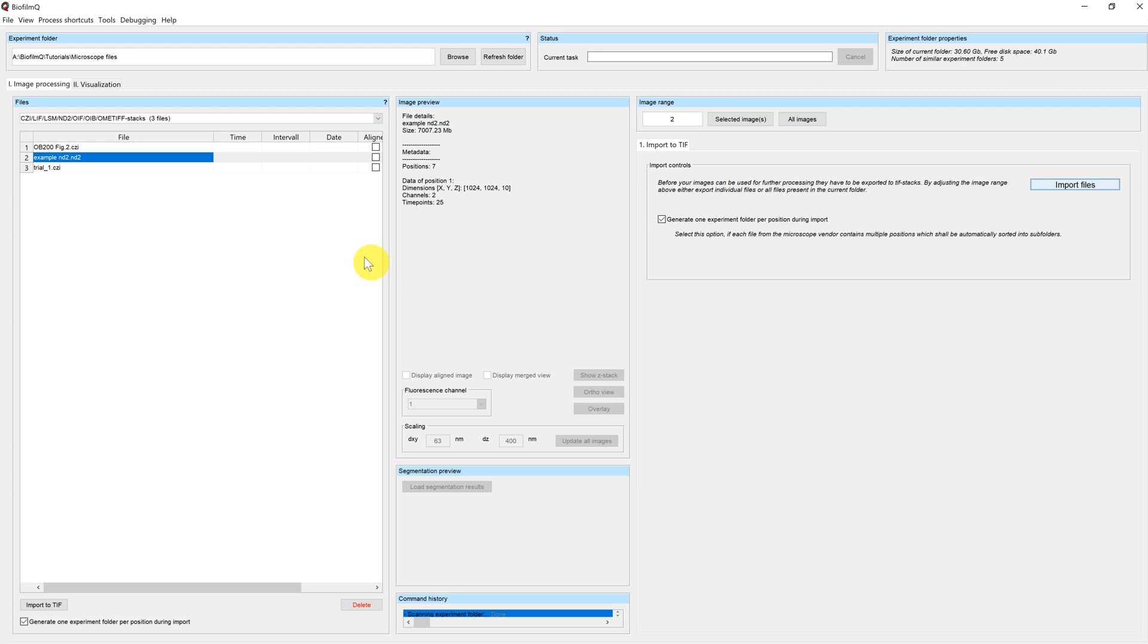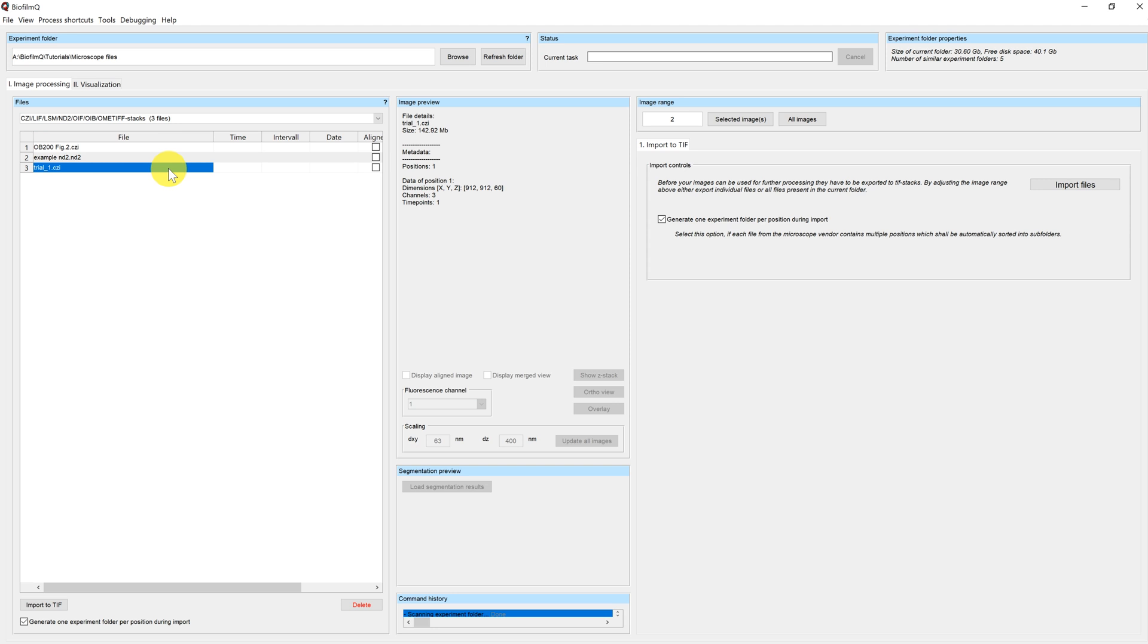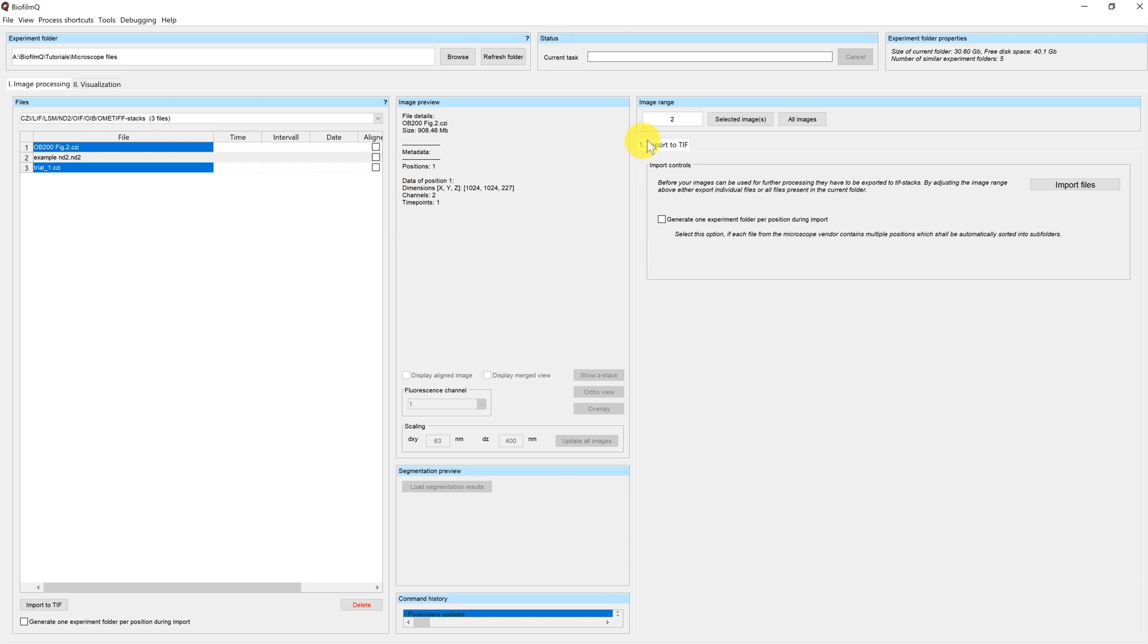So now we want to import the other two files. You can see that both of them only have one position. So we'll uncheck this checkbox because we don't need additional folders. And we will select them both.